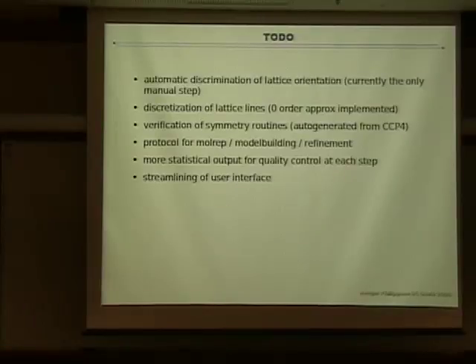Now, what I haven't told you is that we have what we call the ABBA problem. You can have an AB orientation, but you can just swap A and B, and, well, not swap it but move one over. But in essence, we cannot differentiate between the two. We sometimes can if we know it's 0 degrees and it's a rectangular lattice, and the tilt geometry says it must be 60 degrees. Then we know it can't be that.